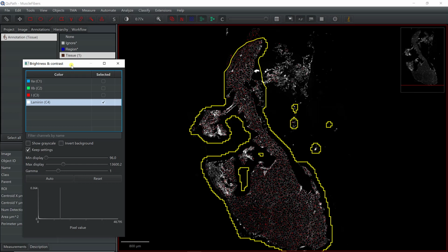That would be 5 different classes, and do it on this image. Or what I can do is just classify the fibers for each fluorophore, so for 1, 2A, 2B, and then apply the classifiers. And if I have muscle fibers that are 1 and 2A, then I will know that I have both 1 and 2A. So that's what we're going to do.